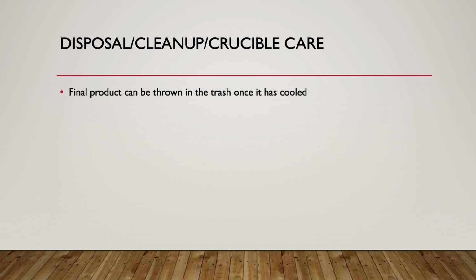You don't want to throw a really hot product in the trash because there's often things like paper towels or things that are potentially flammable that, if your product's hot enough, might set them on fire. So just make sure your product's cooled down enough. You can just go in the garbage, that's fine.